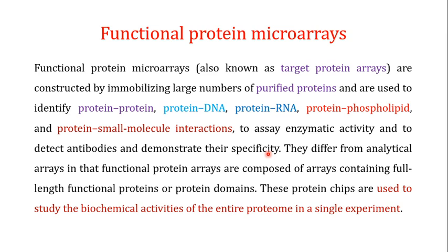Now, the functional protein microarray differs from the analytical microarray in that the functional protein microarray is composed of full-length functional proteins or protein domains, because here you are actually interested in the functional aspect or the interaction aspect of the protein microarray and hence their activities.